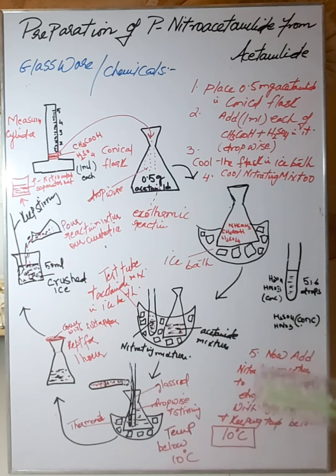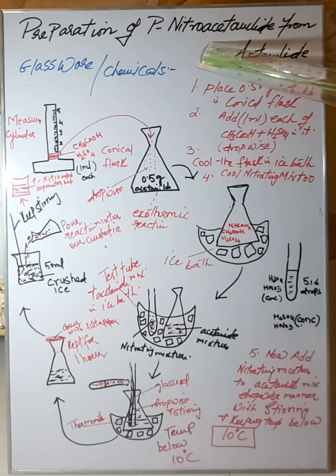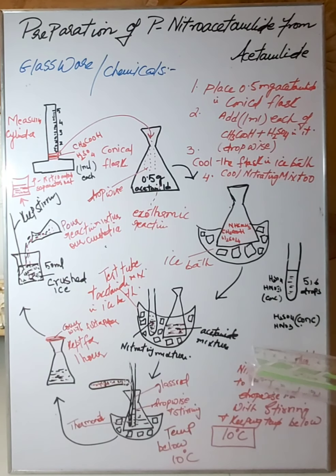You are supposed to follow the steps properly, then you will definitely achieve the product, that is nitroacetanilide, and you will be very happy to get your amazing product.